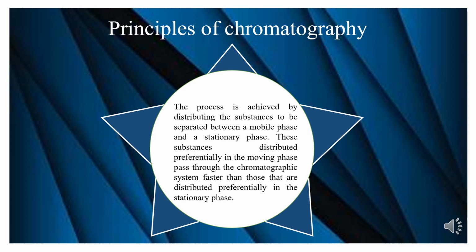Chromatography is a separation method where the analyte is combined within a liquid or gaseous mobile phase, which is pumped through a stationary phase. Usually, one phase is hydrophilic and the other is lipophilic. The components of the analyte interact differently with these two phases. Depending on their polarity, they spend more or less time interacting with the stationary phase and are thus retarded to a greater or lesser extent. This leads to the separation of the different components present in the sample.